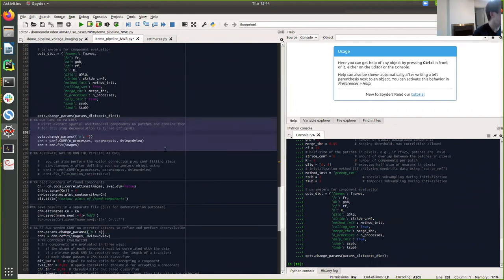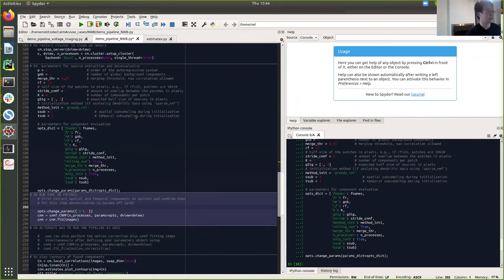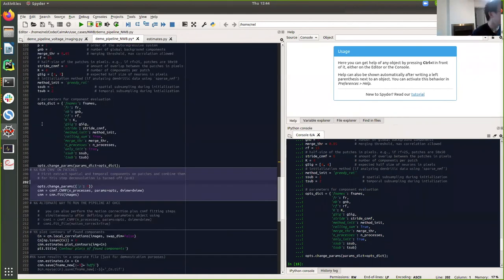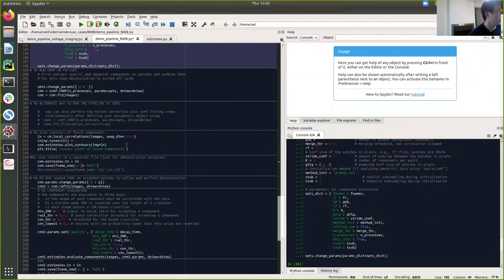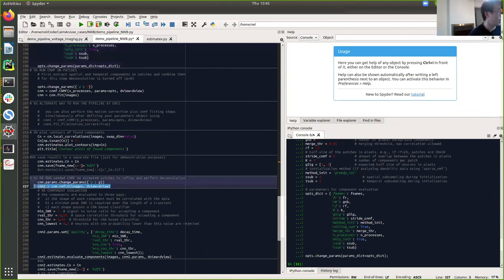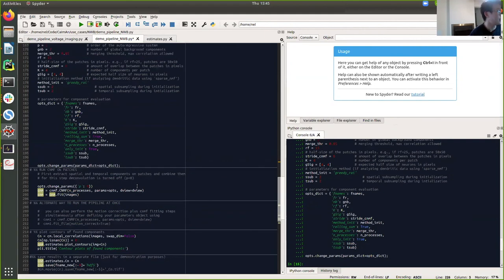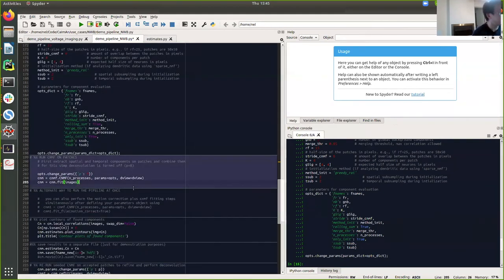So after that, what we want is using CaImAn to do the source extraction and deconvolution. So for source extraction, our goal is to find the spatial footprint of neurons and also the signal of neurons. And in the deconvolution step, our goal is to find the denoised version of the signal using the autoregressive model. And these parameters, Andrea has already talked about it. So we'll just go.